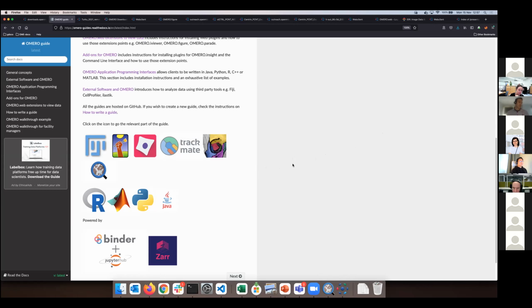You got it right. But everything else is in the web. Yeah, and why is that? Yes. So that was what I was trying to kind of excuse at the beginning. It usually goes like that. That's the reality of software development.